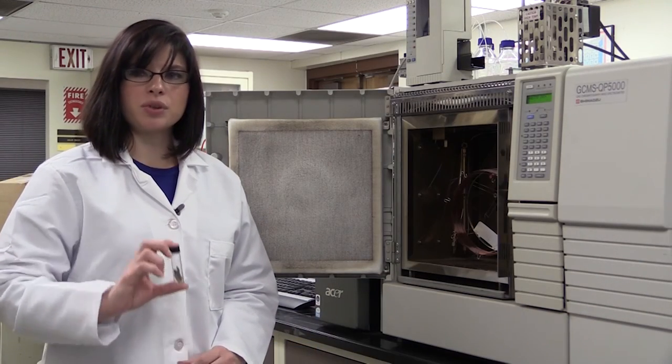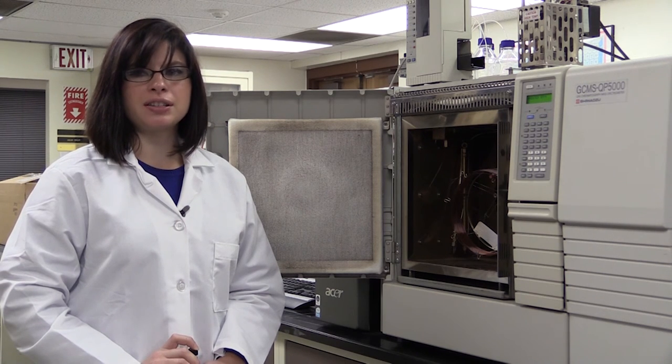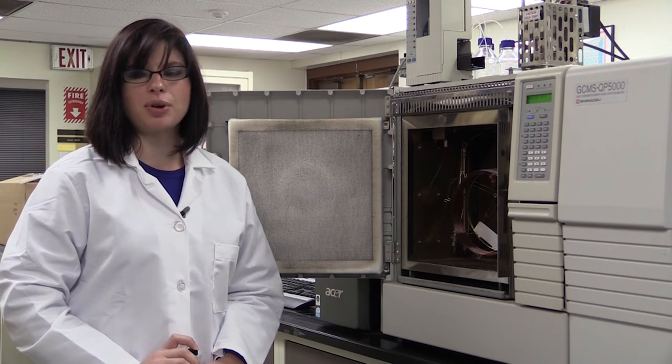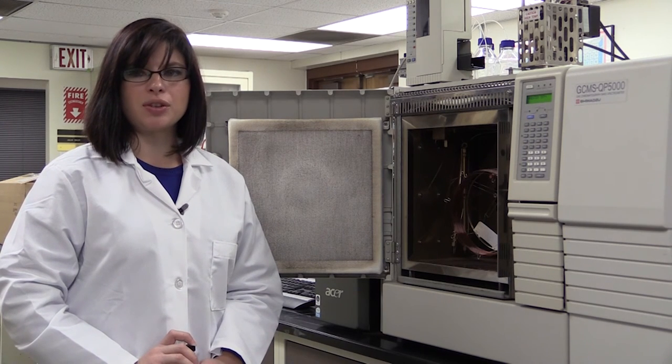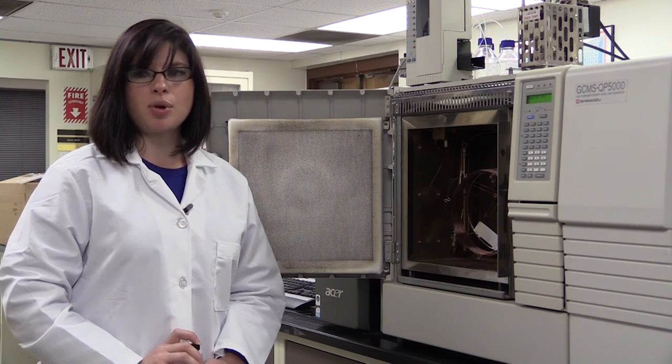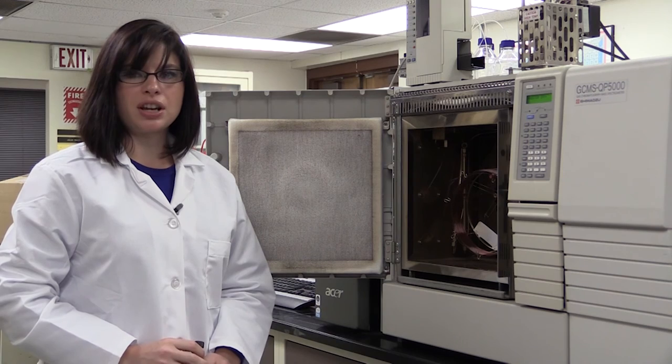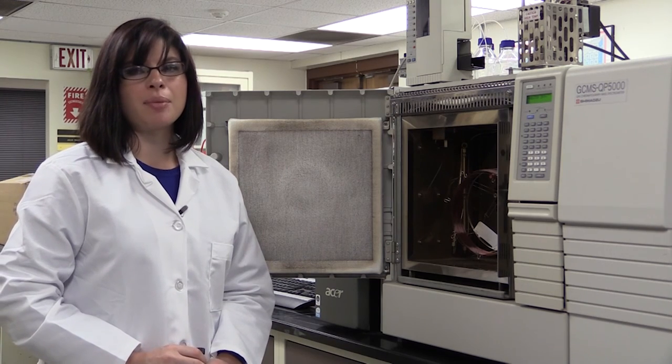Some of the samples sent to the lab were in sealed septum vials. The samples had reportedly been placed in the vials immediately upon removal in an attempt to trap any solvents that may be present. GC mass spec was used to determine if any solvents remained in the coating film. The gas chromatograph separates molecules as they travel the length of the column. Each molecule is identified at a specific retention time by a mass spectrometer.